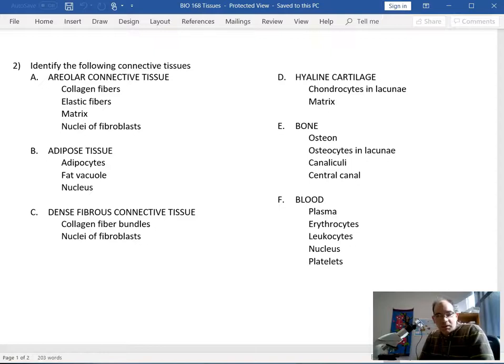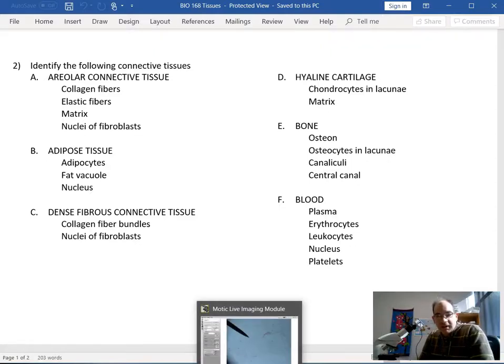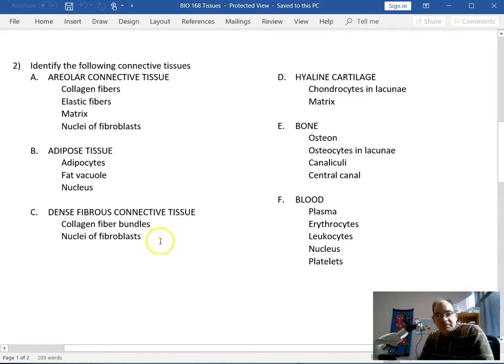In this video, I want to go over some connective tissues and finish off our tissues handout. So what I want to start with is areolar connective tissue.